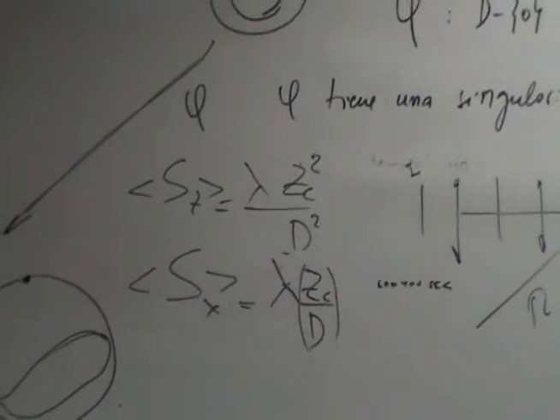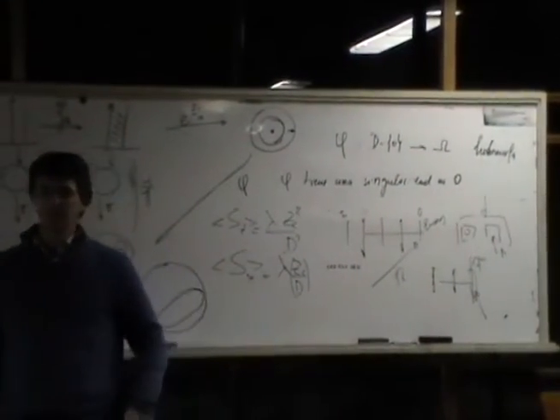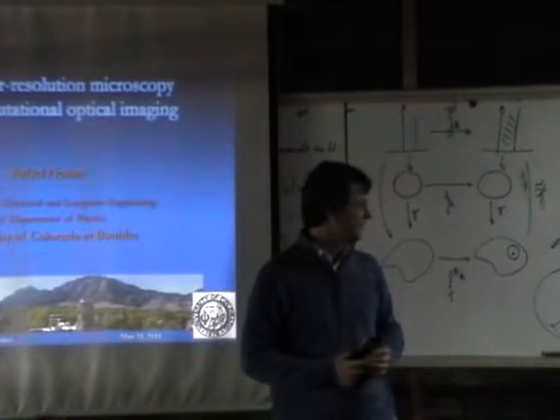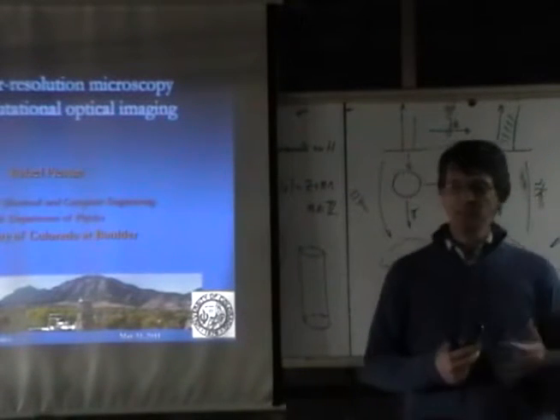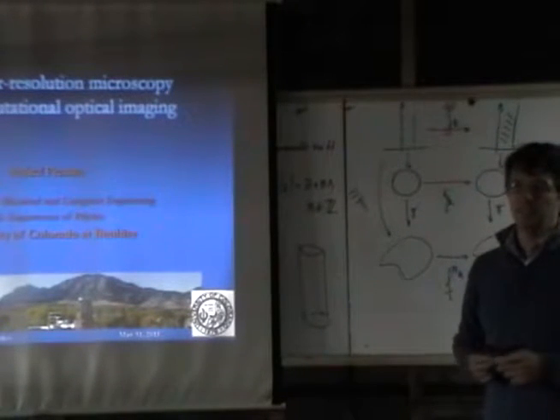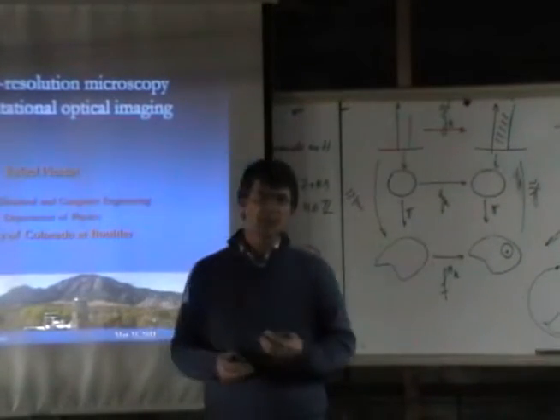Well, the reason you might not be able to see is because of diffraction. Now, this is certainly bigger than the wavelength, so that's a resolution limit imposed by the numerical aperture of your eye, essentially. And if you go far enough, you won't be able to see this, but this is still bigger than the wavelength. Now, if you get closer and closer, like we do in microscopy, you can see smaller things, but at some point, which is about half the wavelength of light, you will not be able to distinguish things that are smaller than that. In 3 dimensions, it's even worse.